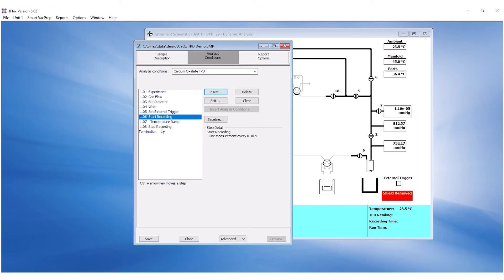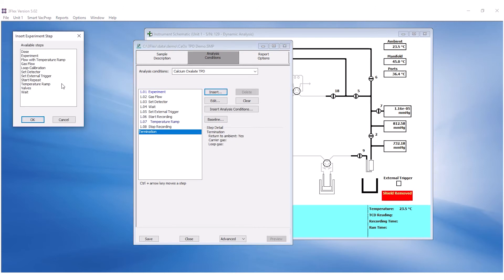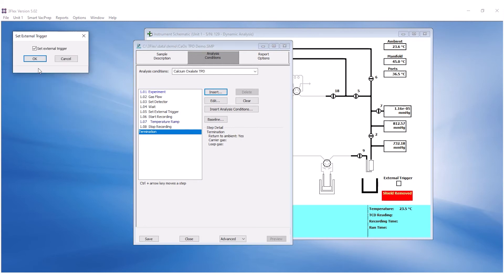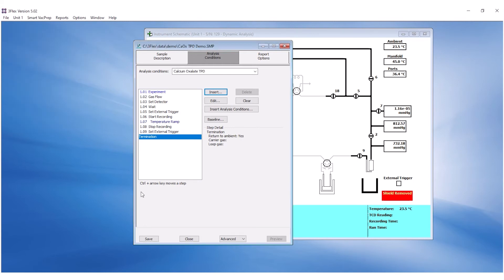Next, insert another step to turn off the mass spectrometer external trigger once the recording is stopped. Highlight Termination and click Insert. Select Set External Trigger and ensure to uncheck the box and click OK to save.